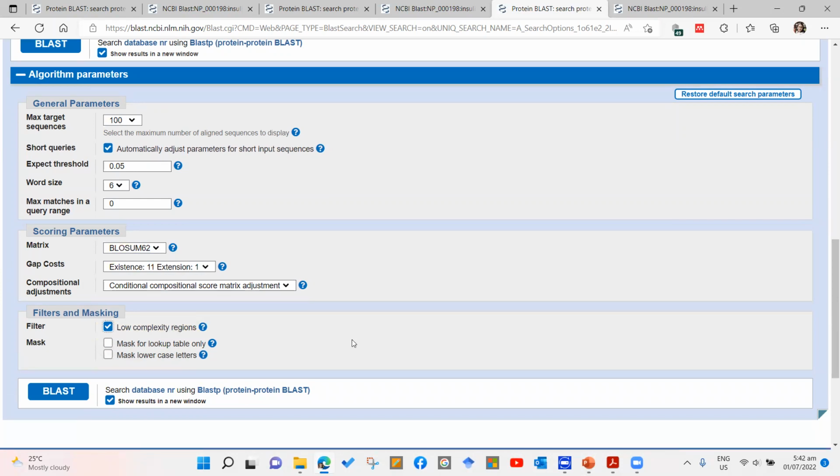So this is actually more of an idiot-proofing, because years ago there was no such thing in BLAST. If you accidentally changed a certain alignment parameter, you wouldn't know you had changed it. I think this is a good job for allowing us to see clearly if we did. Basically, it's idiot-proofing BLAST. So I did run the BLAST search for this one, and I filtered it for low complexity regions.